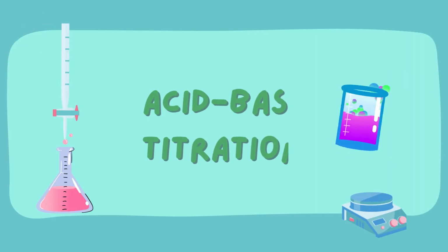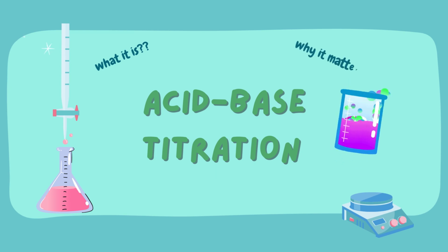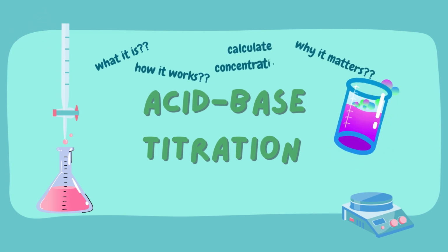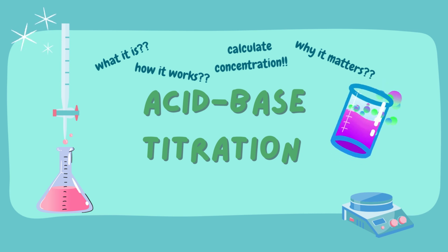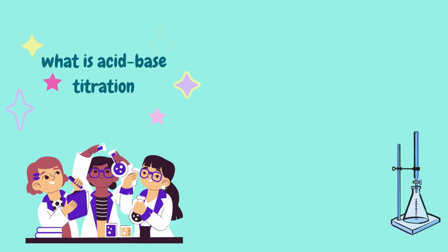Welcome. In this video, we'll cover acid-base titration, what it is, why it matters, and how it works. You'll also learn to calculate concentrations and interpret titration curves. Let's get started. What is acid-base titration?